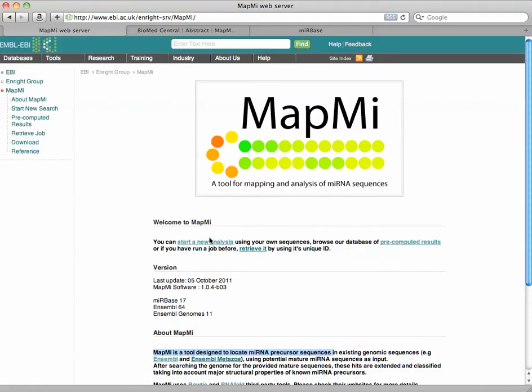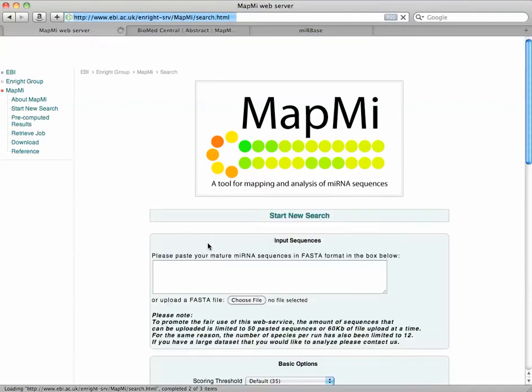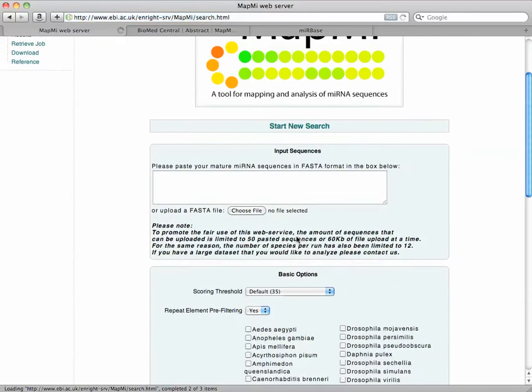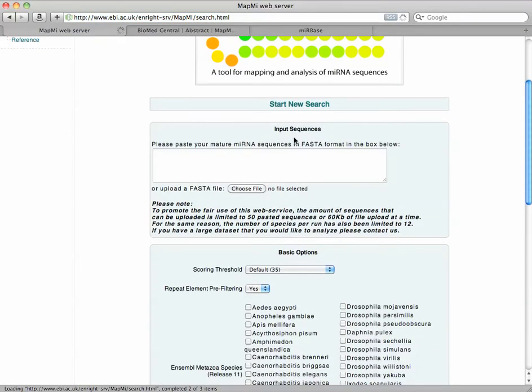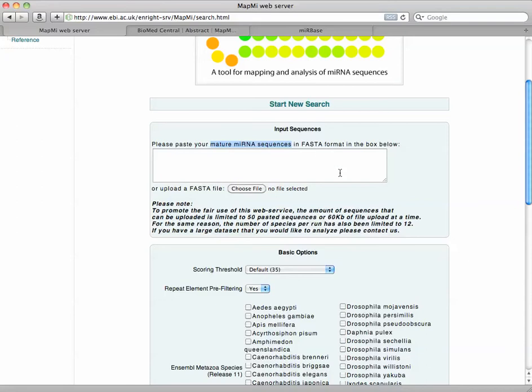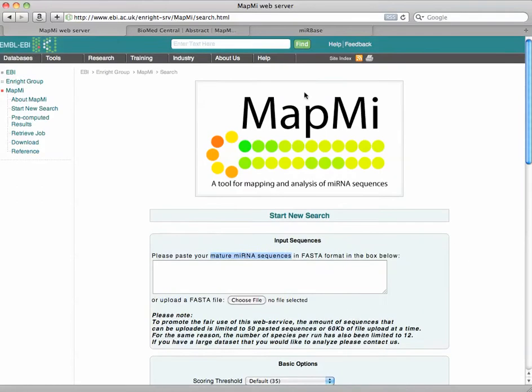So let's get right to starting a new analysis. Now when you start a new analysis, you need to put your input sequence of your mature microRNA sequences, as it says here, in a FASTA format. So let's do that.